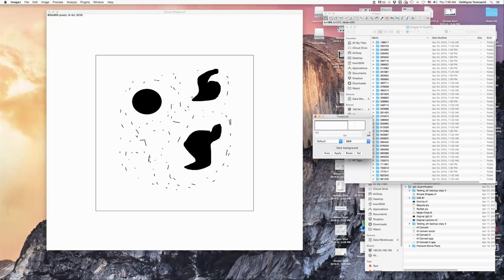So you could trace this by hand, and that would work on this image because there's only 3 areas. But on our real images, there will be 15, 20, 100 different little areas, and doing that is a little impractical. Fortunately, ImageJ and the writers thereof foresaw this, and they include a very nice little plugin called Analyze Particles.